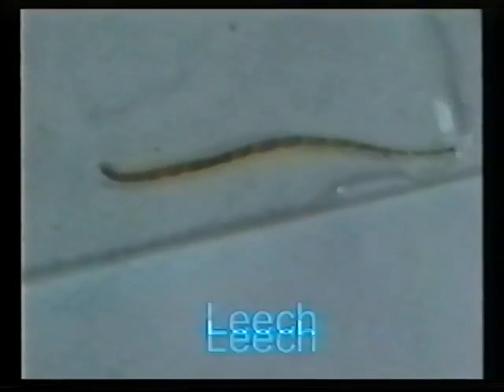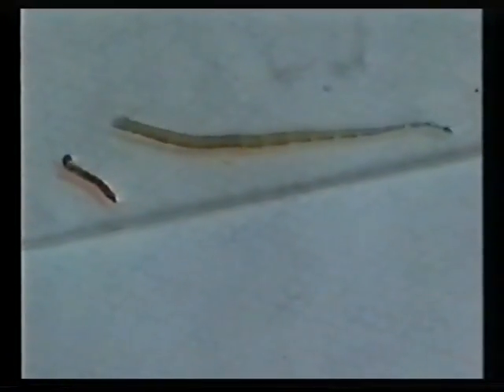The leech is not entirely host dependent on a continual basis. It can survive for many weeks away from the host after a satisfying feed. Leeches are hermaphroditic, therefore do not need a particular mate for reproduction. Similar to the fish louse, it injects an anticoagulant into the host to ensure clotting of the blood does not occur.